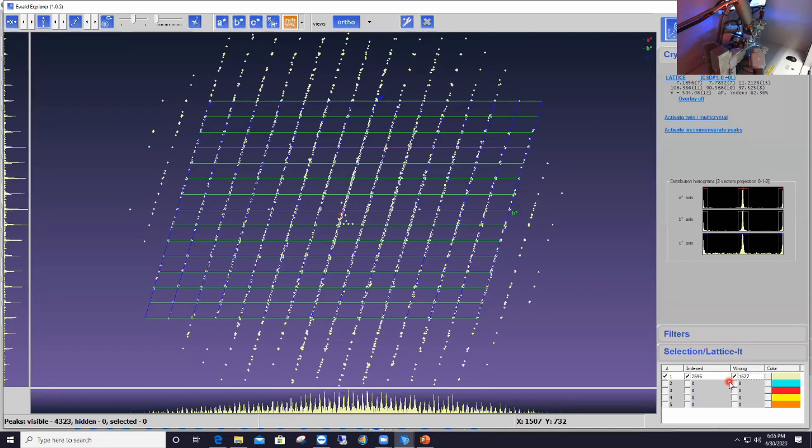And when you see something like that, your first reflex should be to discard that crystal and screen some more, hoping to find a crystal that will show one single and clean diffraction pattern. Now, that twin was also particular because the additional reflections are along that axis here, the vertical axis. It doesn't have to be that way. So additional reflections may appear randomly in between lattice points, right? They don't have to be only along one of the axes. So this is one example.